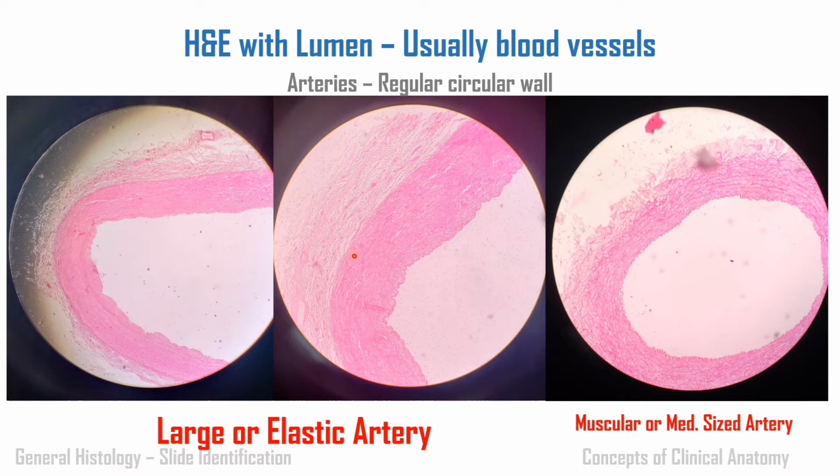And one more clue to identify the large and medium-sized artery. In most slides you can appreciate the lumen completely or almost completely in the medium-sized artery. In the large artery the lumen is larger, so you can't appreciate the whole lumen in 10x power.